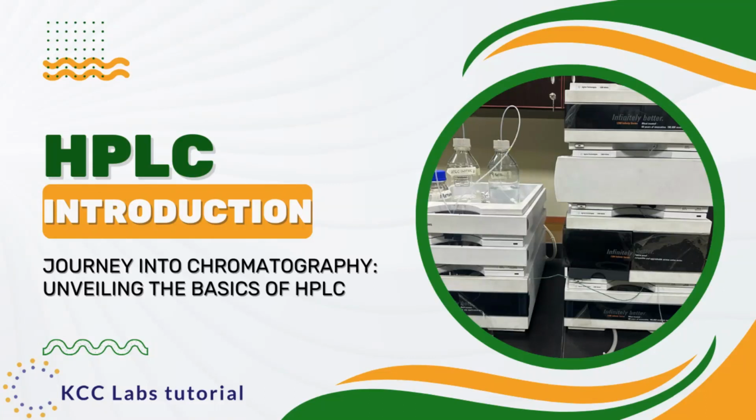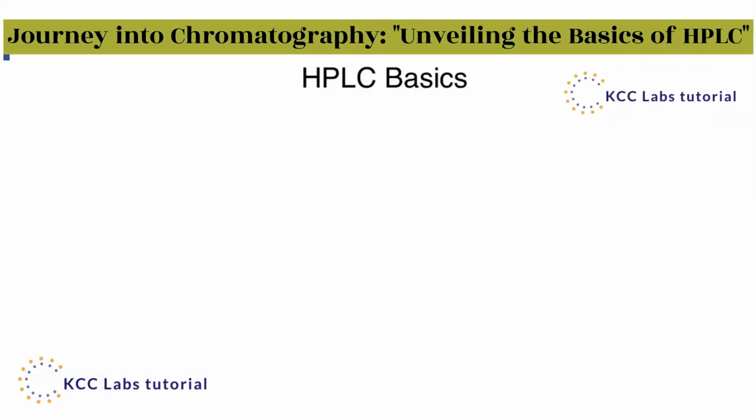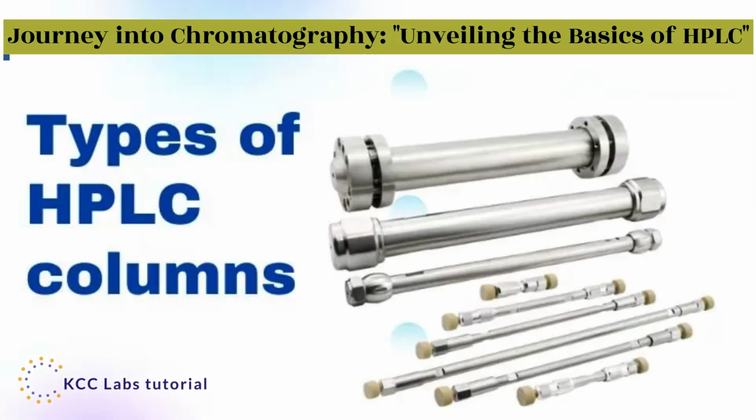We are going to be introducing an introductory course to HPLC chromatography. HPLC stands for High-Performance Liquid Chromatography, and in this first lecture we're going to take an overview of HPLC and learn some of the basics, and then we will get into more detailed parts as the lecture series continues, into different types of columns and how to manipulate mobile phases and things of that nature. So let's go ahead and get started with a general overview.